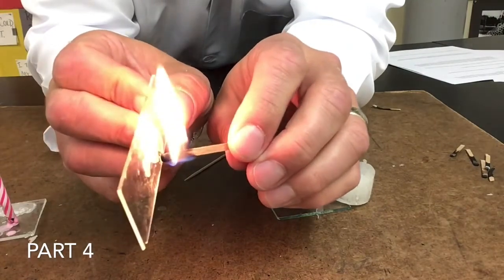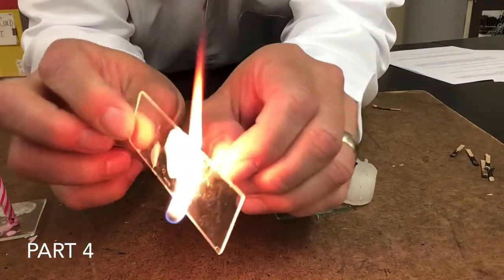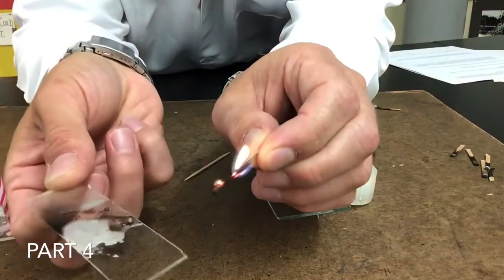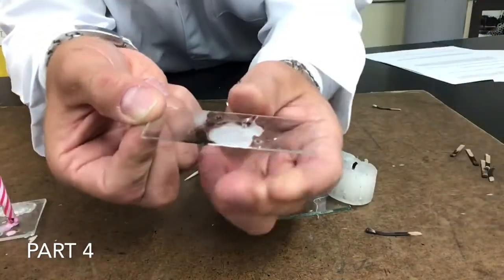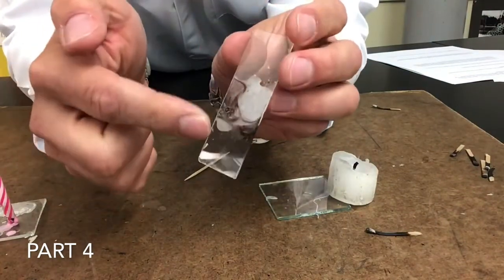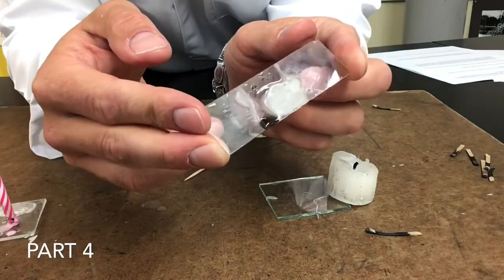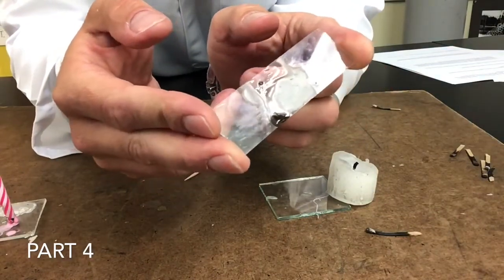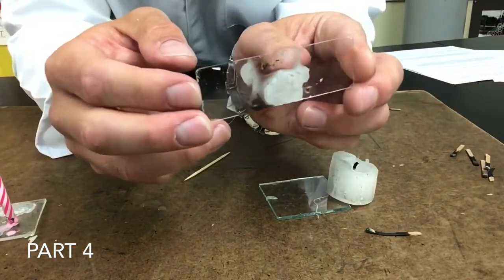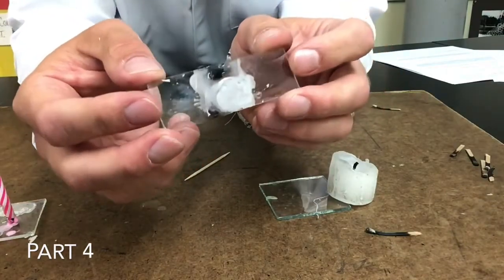Let's see. Well, the match is burning very well, but unfortunately the wax is not catching. In fact, it is simply just turning back to liquid. You can see a little bit of the black soot from the burning match, but nothing too crazy. So the wax looks like it won't burn, it just simply melts again. So that's another observation. Make sure if you need to, you can pause this video, write down the observation in the proper part during part 4.